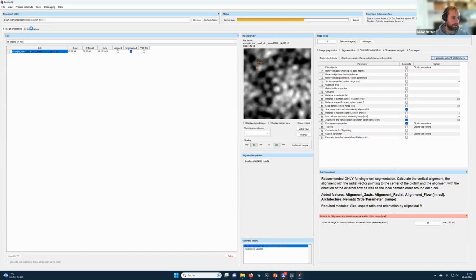Okay. While we wait, are there any more questions? Because with this, we are actually through most of the part that we wanted to show. I would be open to any questions or help that you need. As Eva and Hannah are here, we could also help you with any other questions about BiofilmQ, maybe not directly related to single cell segmentation, although that is the topic of today's workshop. So we are open for any questions that you have.